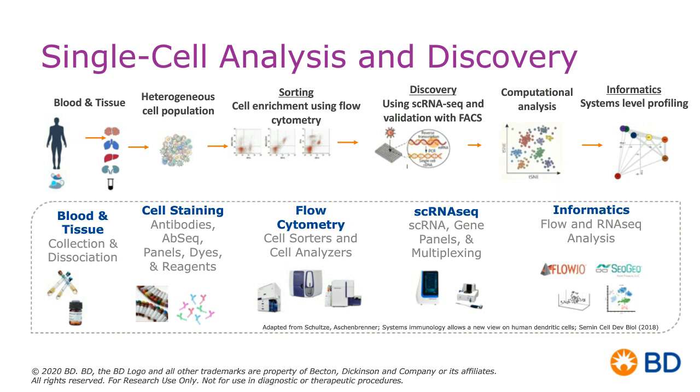In addition, we often have the computational analysis component. Now, this is often challenging, where people can generate a tremendous amount of data and information from platforms where you're doing single-cell RNA sequencing or proteomic and genomic analyses. And there's sometimes a bottleneck when it comes to the bioinformatics analyses.